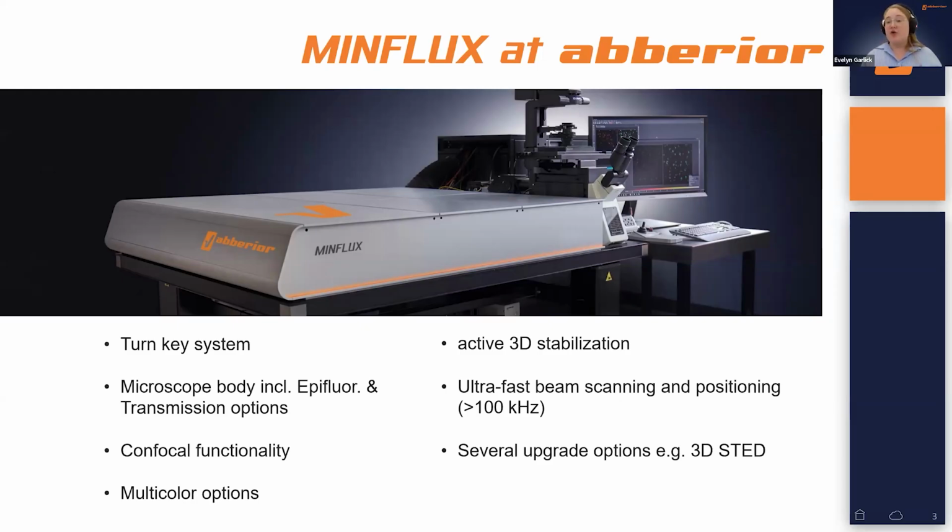The most important part for our very high precision imaging is that active 3D stabilization system that you were shown. This is comprised of an additional piezo stage that sits on top of our regular microscope stage. As we measure, we record those slight deviations from the reference position that we set. We are able to actively correct for those, which means that it's an active process as opposed to something that we need to apply in post-processing, which is what is usually done for single molecule measurements that are camera-based.